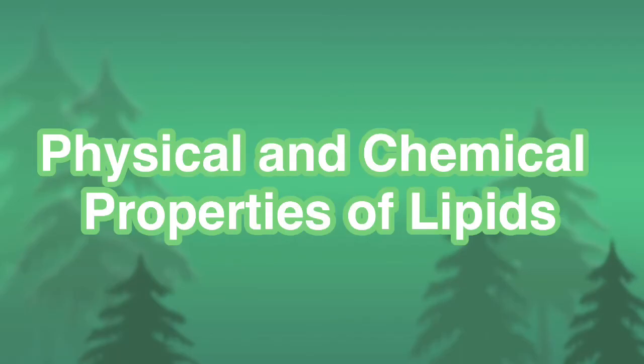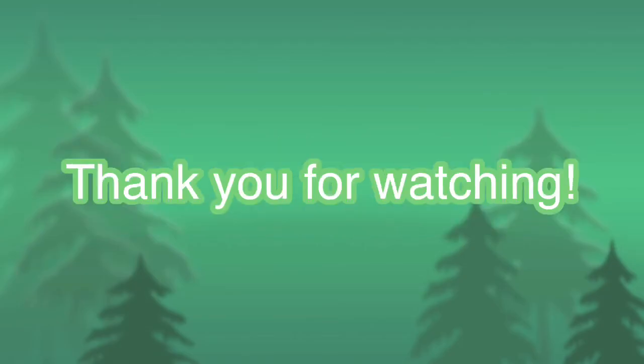So in this video, I have just shown you some physical and chemical properties of some commonly encountered lipids. May these help you in answering your worksheet.